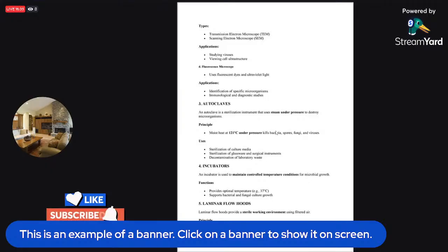I've seen some people that work in the laboratory with culture media, and instead of autoclaving before discarding, they will just go and put it in the environment. By the time they discard it in the open, don't forget, they have polluted the environment. So that is autoclave.